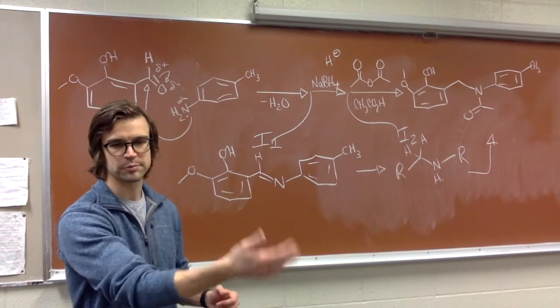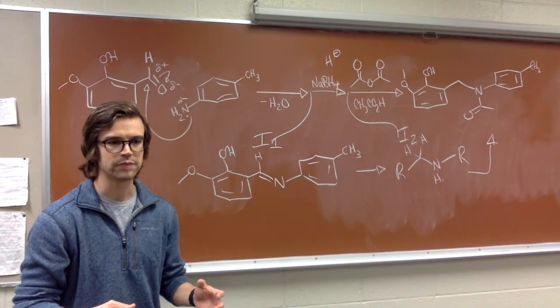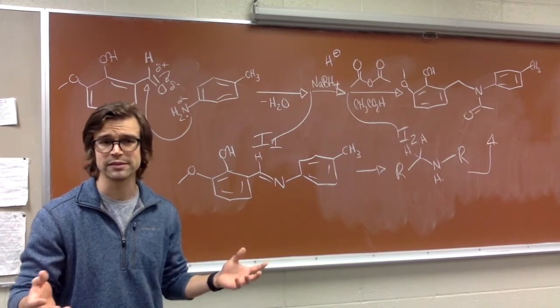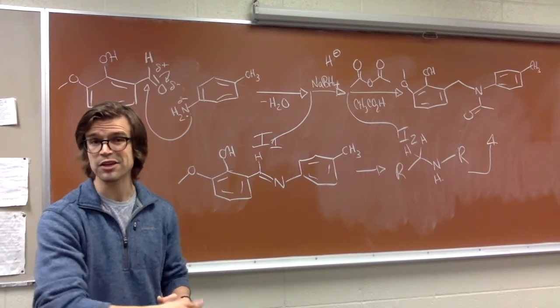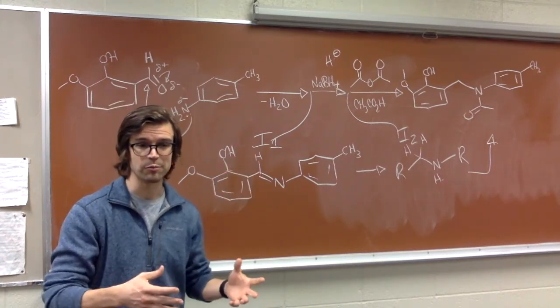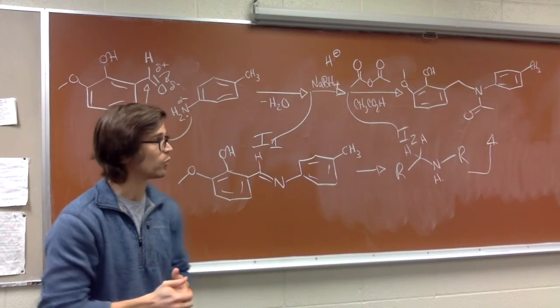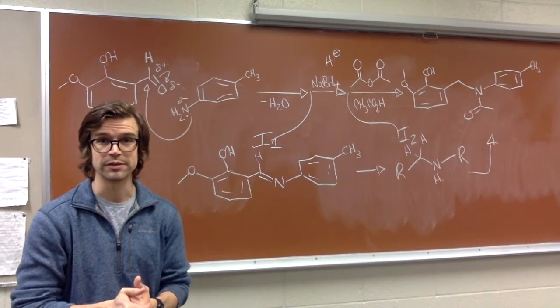And the final experiments in this sequence is a lot of kind of discovery or problem-based reactions where, again, you don't know what you're making. So this is kind of the most complicated thing that you'll make, that you know what you're making, and it's kind of getting you ready for those future experiments.